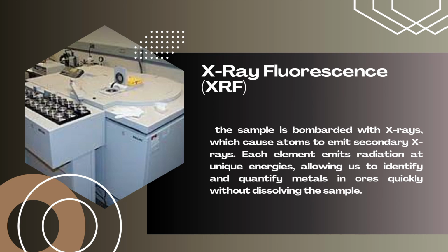Now is the X-ray fluorescence or XRF. The sample is bombarded with X-rays, which cause atoms to emit secondary X-rays. Each element emits radiation at unique energies, allowing us to identify and quantify metals in ore quickly without dissolving the sample.